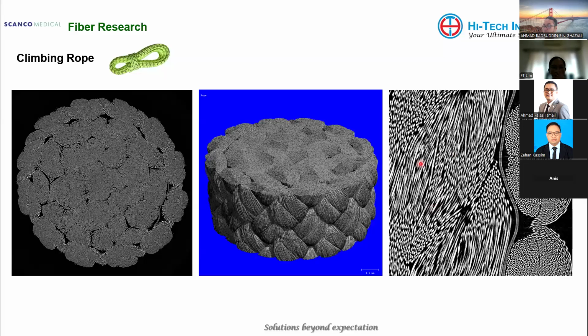So we have to understand the concept of rotating the samples and capturing the shadow. So after we get sufficient rotation and back projection of the shadow, we are able to reconstruct all these complicated features into what you are seeing now. So it's very intelligent software behind this MicroCT.